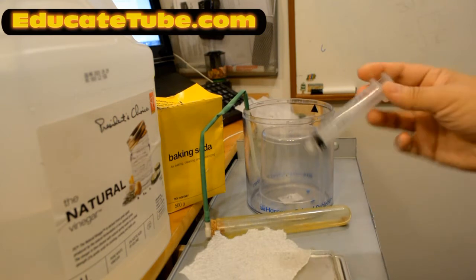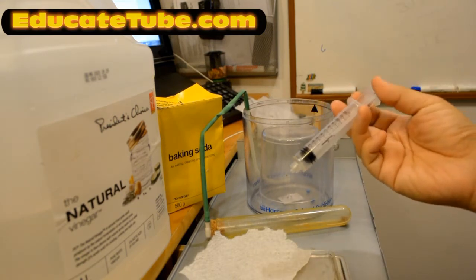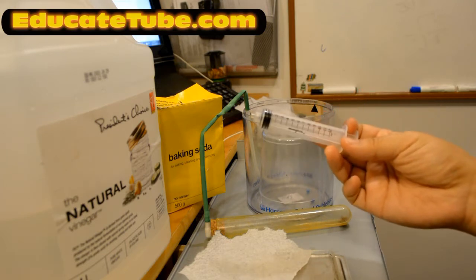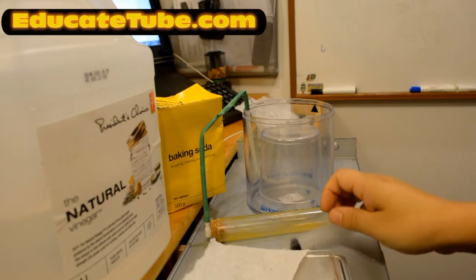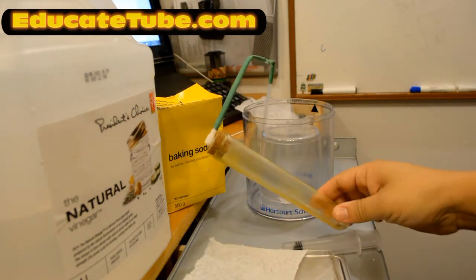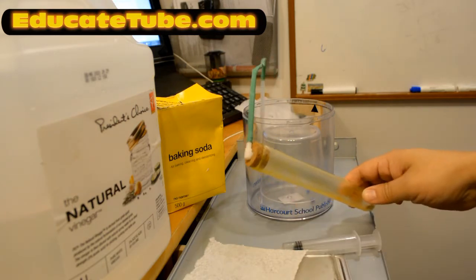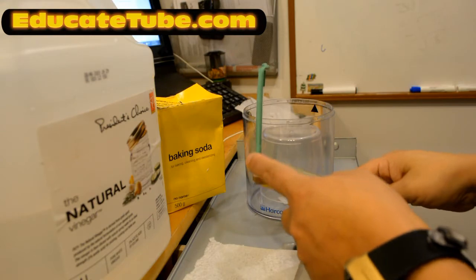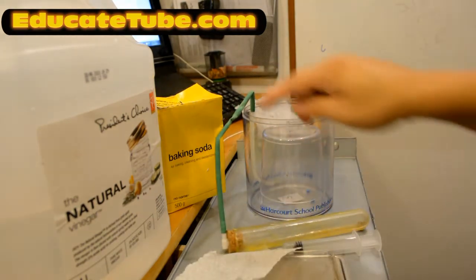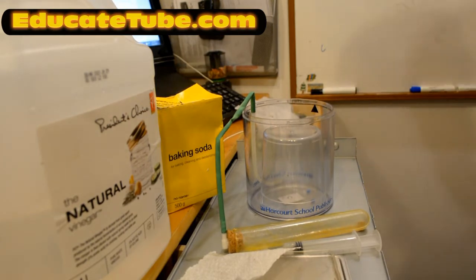You also need a syringe to measure the volume of acetic acid. I have a 12 milliliter syringe. And then you have a large test tube. This is a plastic test tube with a stopper on top, sealed, and there is a tube that runs down into this plastic container. Now you probably wonder what it is, right?